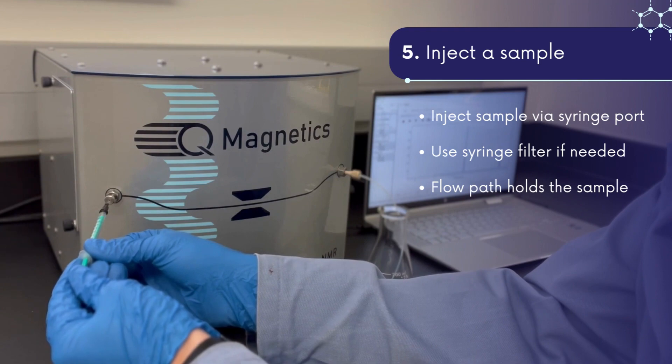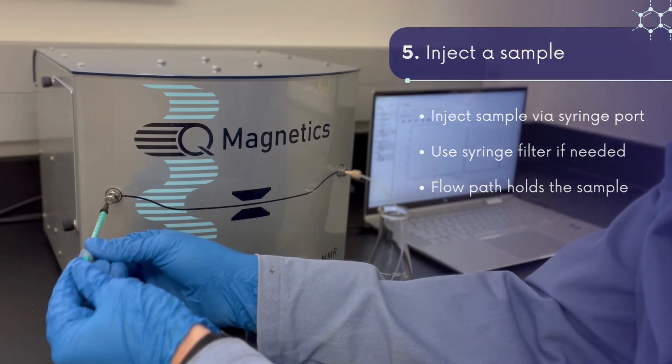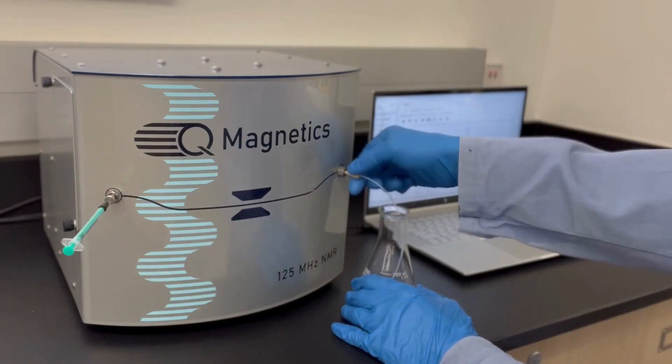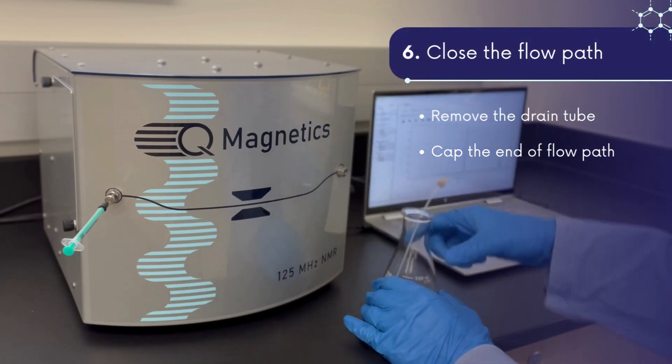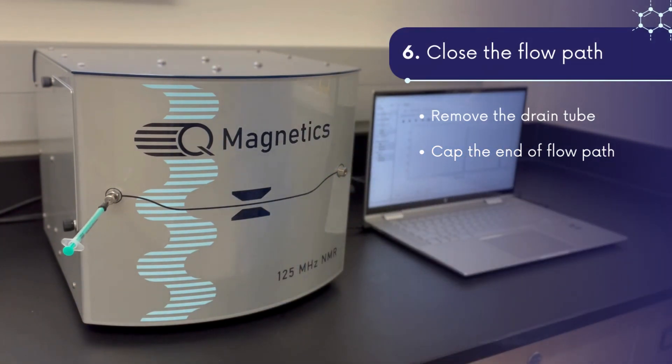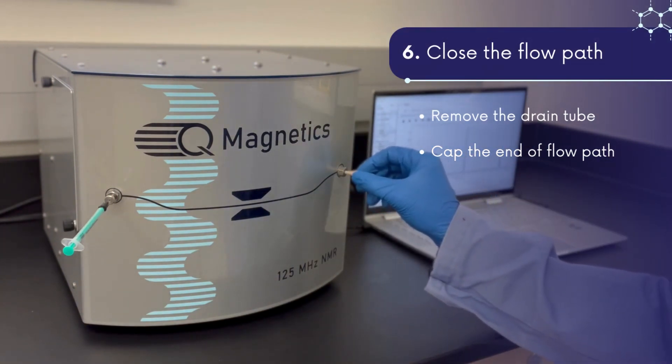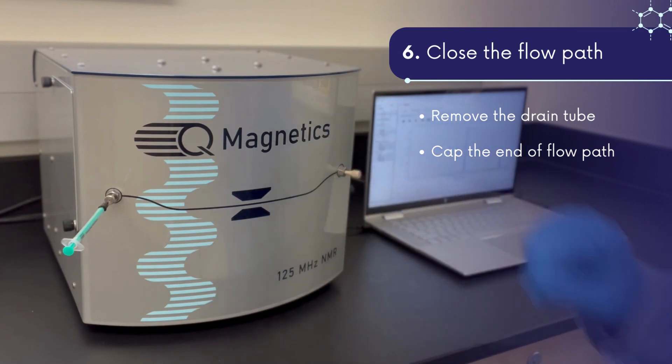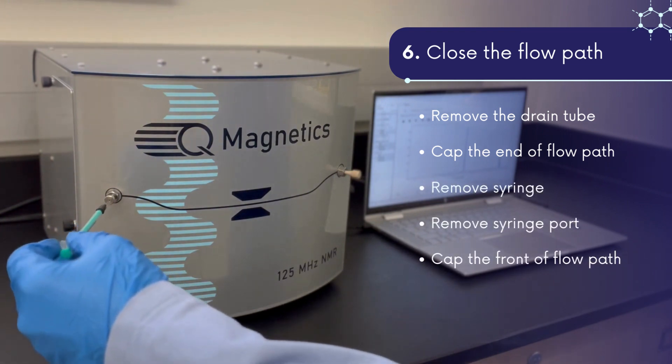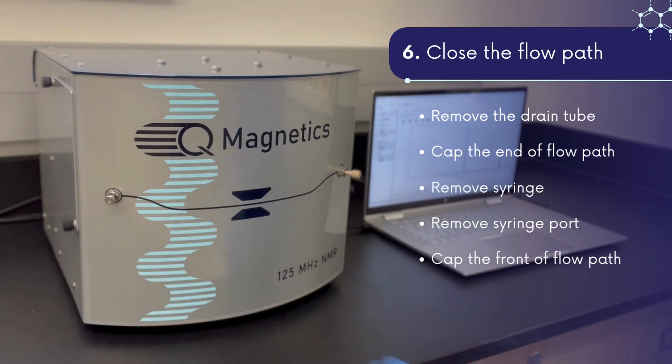After injecting, the sample is now loaded in the flow path. Now, before removing the syringe, first remove the drain tube and close the end of the flow path with a port cap. The syringe may now be removed, followed by the injection port. Lastly, close the front of the flow path to contain the sample for measurement.